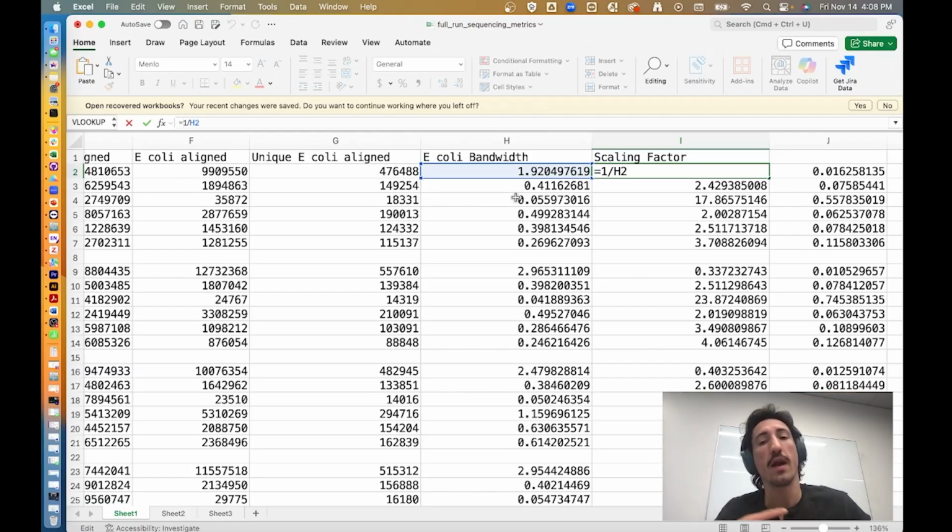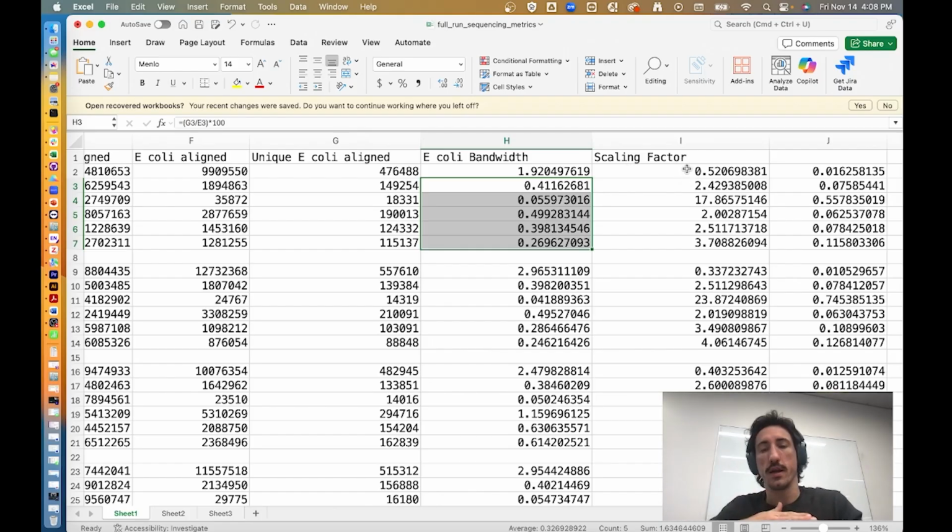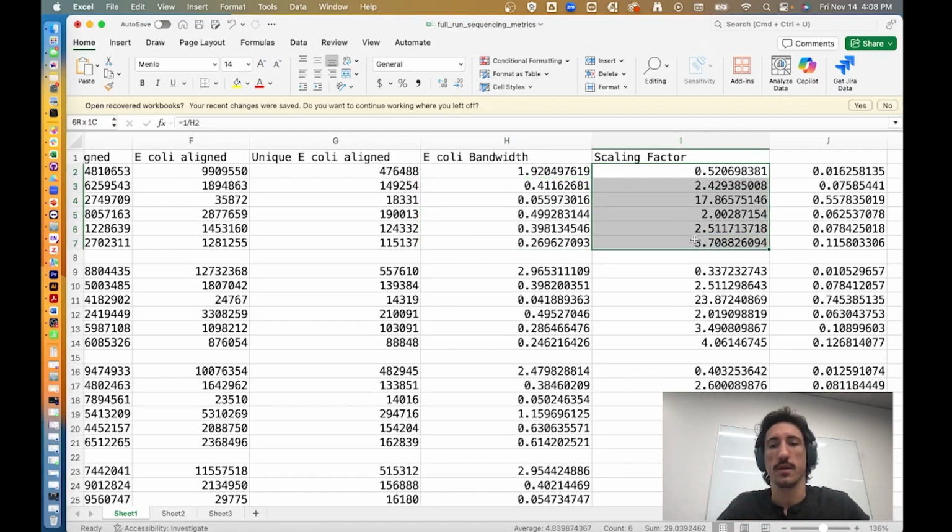So at least within CUT&RUN, what I did is I multiplied my bed graph files by the scaling factor prior to peak calling, just to minimize IgG signal, because as you can see, there's a lot more E. coli DNA proportionally to the actual antibody target DNA samples. And so you're basically shrinking the signal of that IgG so that it is background and it's not overwhelming the samples that were actually eluting DNA with antibody binding and cleavage.